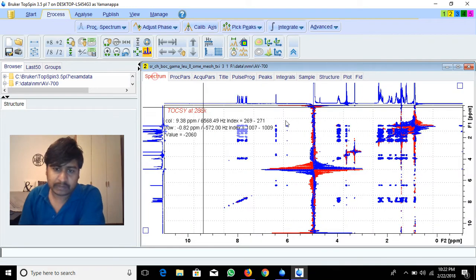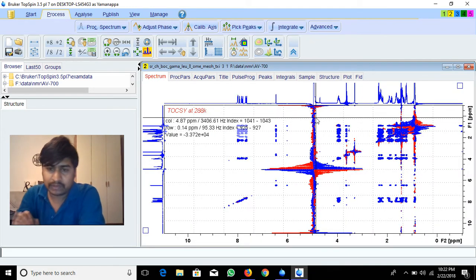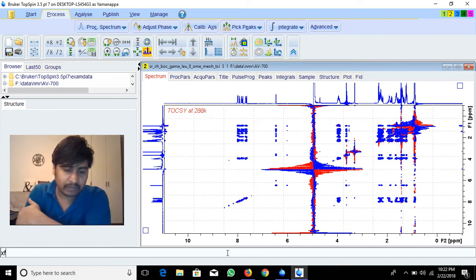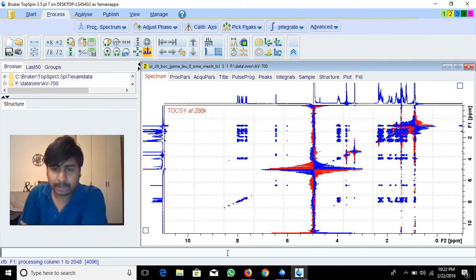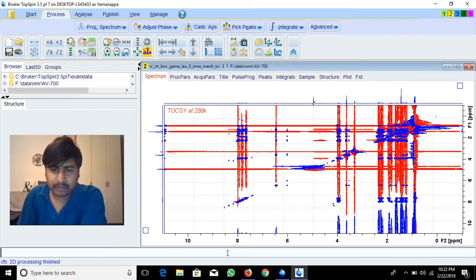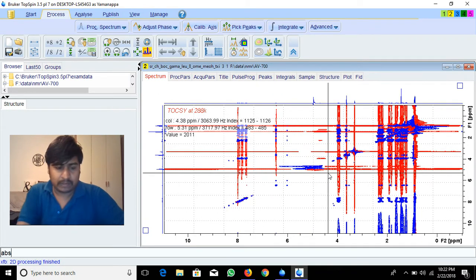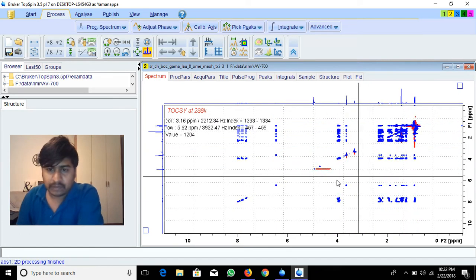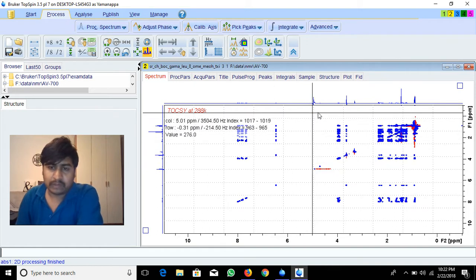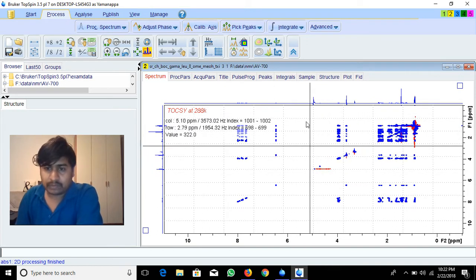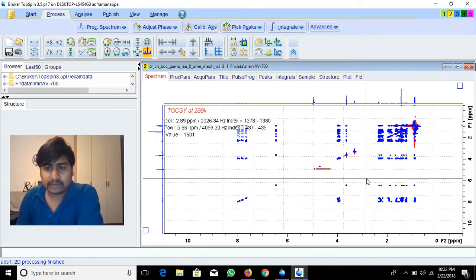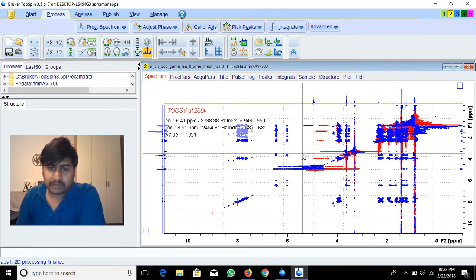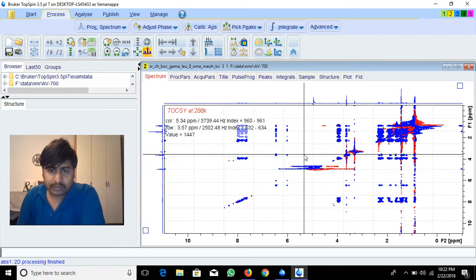You vary this width to select how much region to suppress. I set it to 0.5 and run the xfb command. Now it's suppressed — see abs3, abs1 — there is no noise below the water peak anymore. It's suppressed completely.